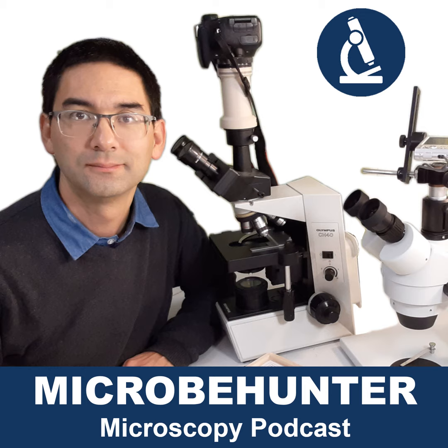However, there are a few points which really speak for stereo microscopes. I already mentioned them before. The ease of use, especially with children, certain specimens that you simply cannot observe under a compound microscope, it's not possible, and also the spectacular pictures that you can get. I don't know, you just have to look. I cannot describe this. You just take an insect that you find somewhere, put it under a stereo microscope, and look at it. It's so fascinating, I cannot tell you. Okay, so the visual impression that you get with stereo microscopes can be really captivating.